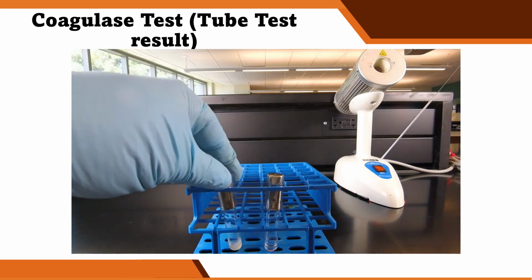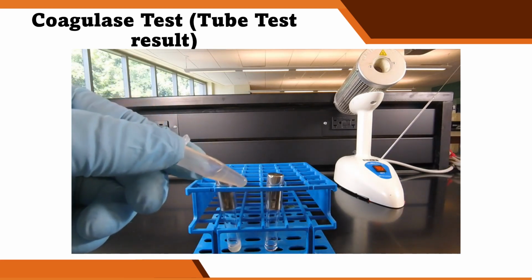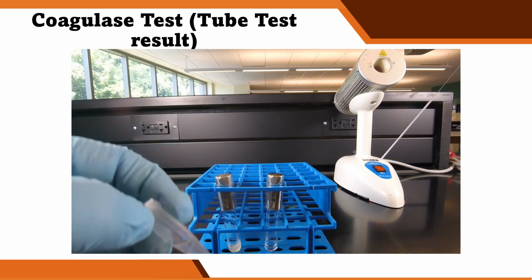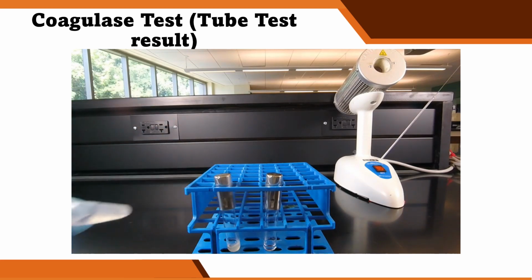Now in a lab, we're going to be doing this using these small centrifuge test tubes, but these are a little harder to see the results on when I try to video it, so I've showed you the results in a tube rather than in the small tubes that we'll be using in a lab.